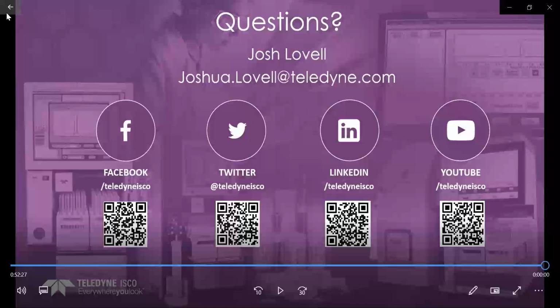So anytime you add a media like that that's similar, essentially you're just elongating the length of your column and creating a little longer separation. And you should precondition that C18.